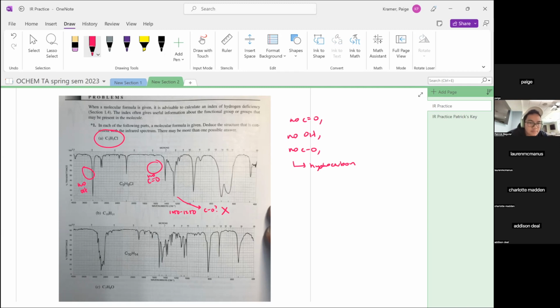And it'd be some type of alkyne with the Cl in the end. If we wanted to draw the structure, you could probably guess pretty easily what the structure is from that, because we only have 3 carbons. So there's not much you can do in terms of connecting it. And the Cl would just be on the end.